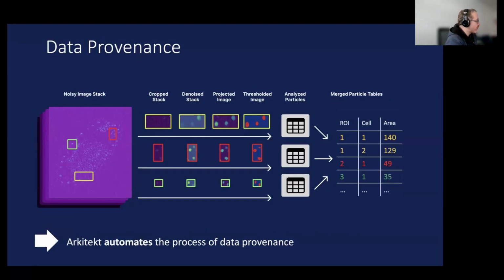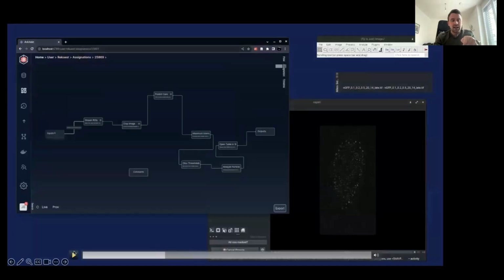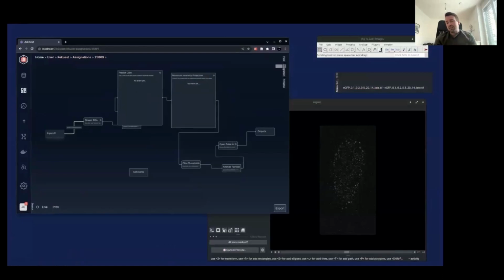And you have such a sort of PDF or Excel or text output that gives you this information. So it's called a run. Actually, a run is sort of a JSON representation of all of the tasks and at which point they happened. Right now we're doing a massive overhaul, so I cannot show you this feature now, but you can export this and put it on a website, and people can just go through the timeline of what happened, using the same interface that we saw here. So they have the same visual representation. They can just go through it and see what happened with each data point. So that's something that you can publish.